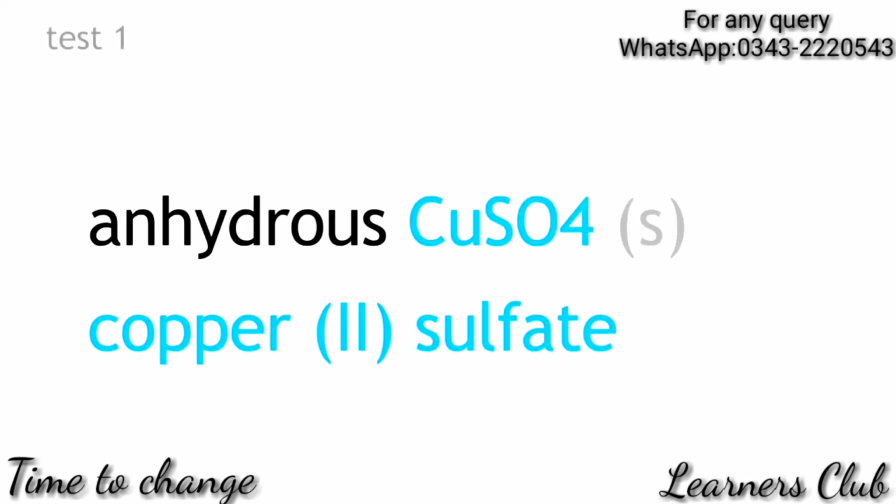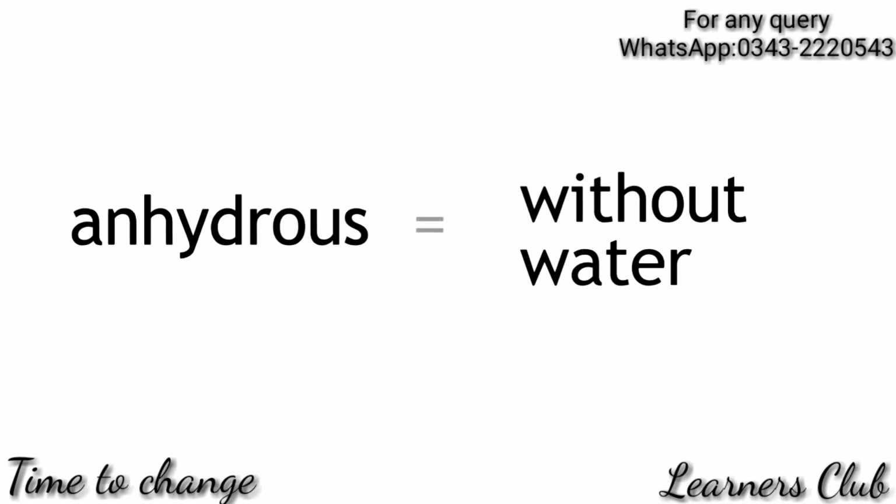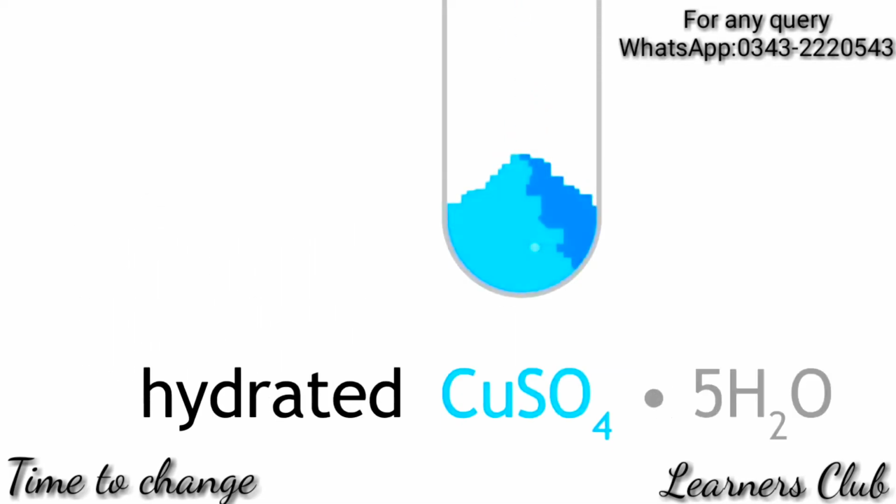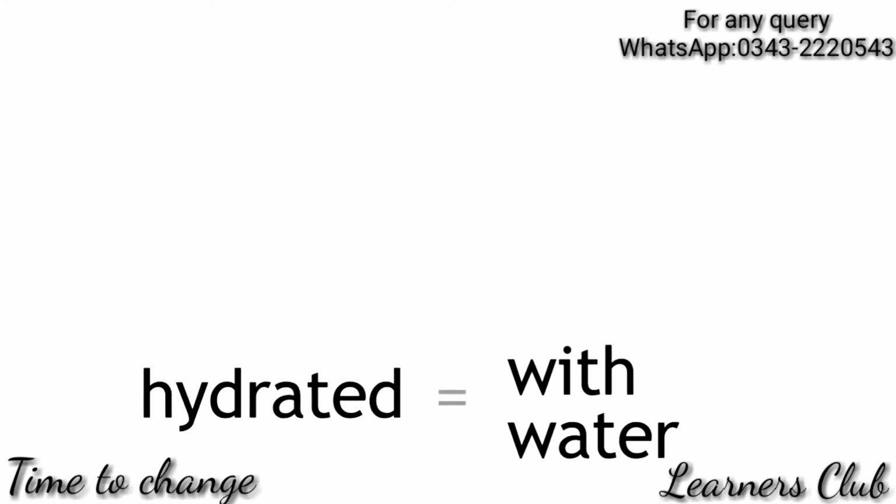The first test involves the usage of anhydrous copper 2 sulfate, which is an off-white solid. The term anhydrous means without water. In the presence of water, anhydrous copper 2 sulfate becomes hydrated copper 2 sulfate, which is bright blue. The term hydrated means with water.